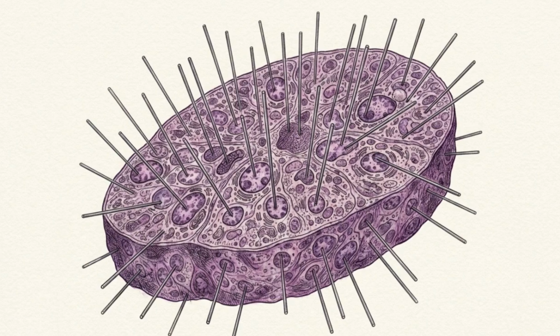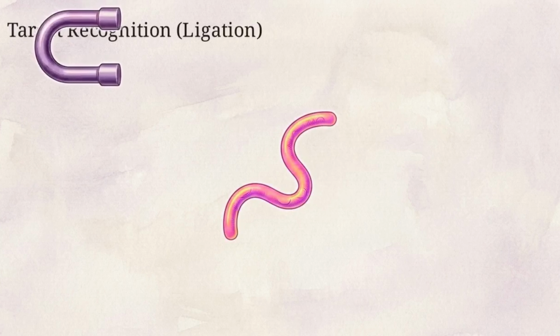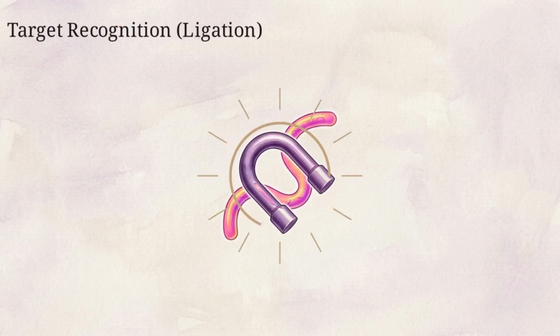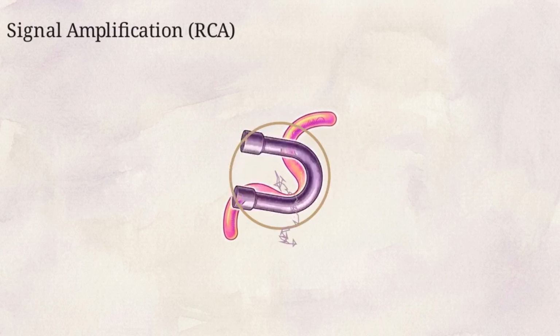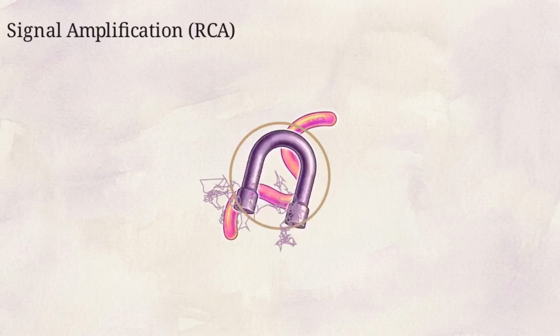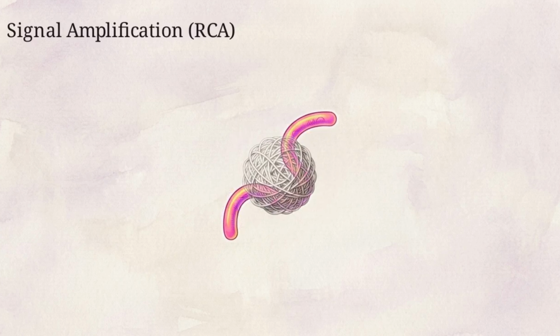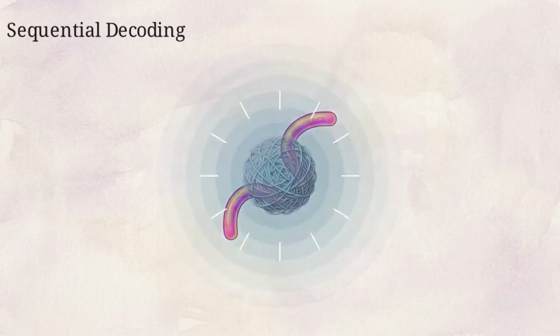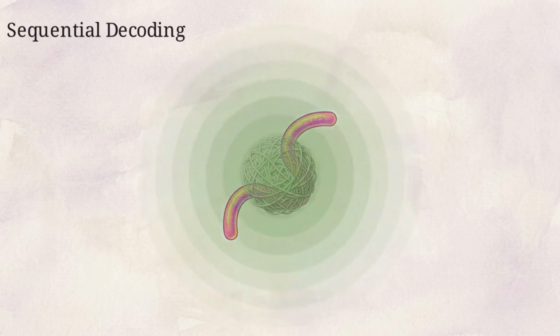Platforms like Xenium and CosMx abandon the solid-phase substrate entirely. They probe RNA molecules directly within the intact fixed tissue matrix itself. This diagram illustrates the padlock probe. These probes hybridize to specific transcripts, circularizing into a closed loop upon matching. Rolling circle amplification then spins out a nanometer-sized knot of repeating DNA anchored to the RNA. Finally, cyclical waves of fluorescent reporters bind to the knot, flash brightly, and are cleaved away.